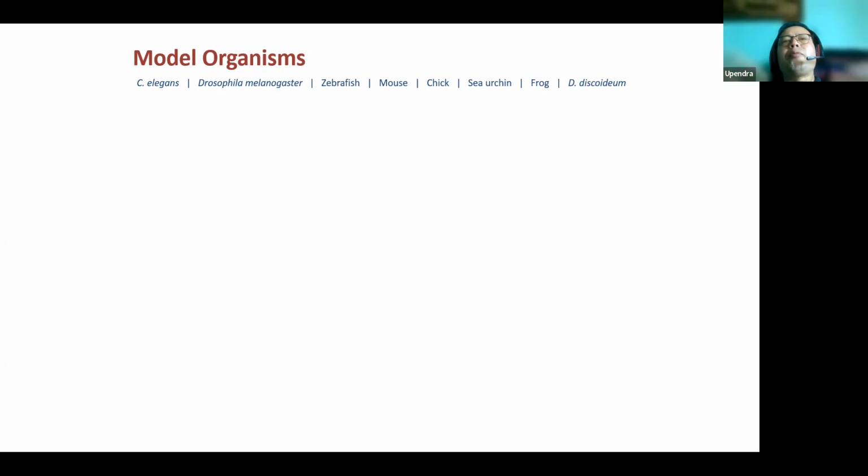I'm talking about the green fluorescent markers, or some other dye which can change according to the acidity, or according to cell division, or change in the environment. That is also more important, besides the development of microscopy.